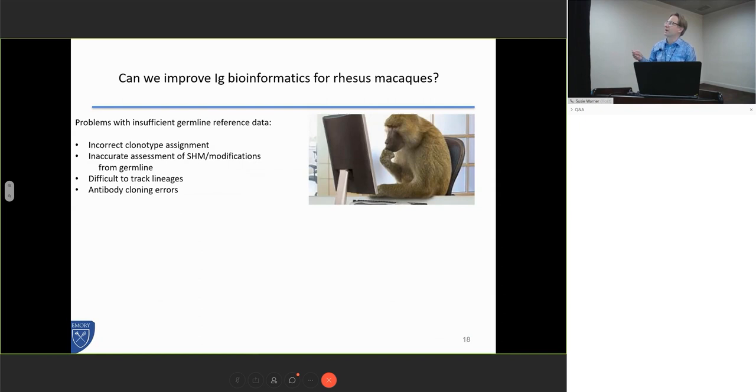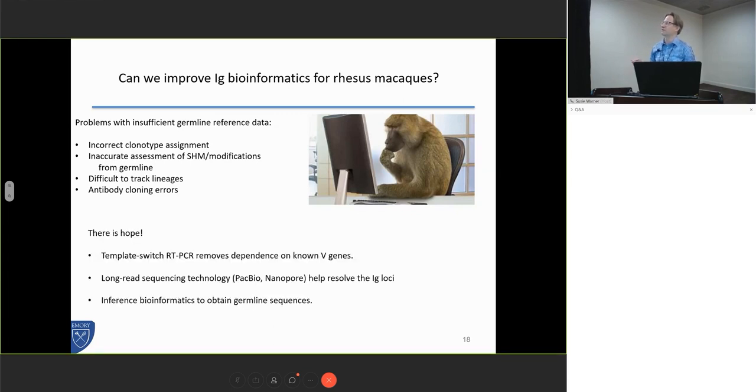The genome I like to use a lot is MACM, and it does have the heavy and light chain loci misassigned according to a more recent reference. That actually doesn't matter, as I'll show in this next slide. Can we improve bioinformatics? We've got a lot of problems still. If you don't have good germline reference data, you can't call your clonotypes correctly. It's very hard to follow somatic hypermutations and understand how impactful your vaccine or adjuvant is. It's difficult to track lineages, and you might actually even start cloning the wrong antibodies out if you're relying on a reference.